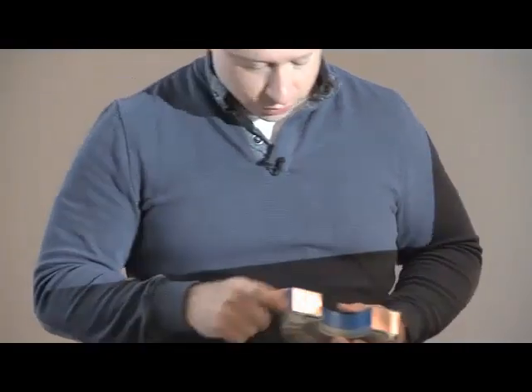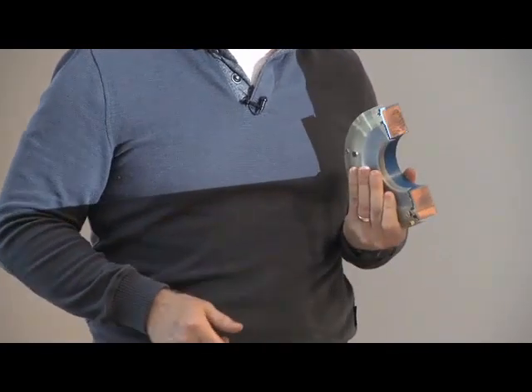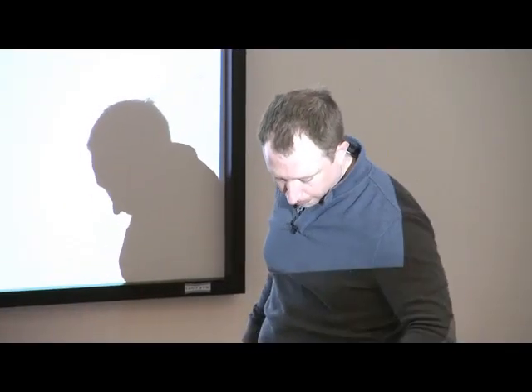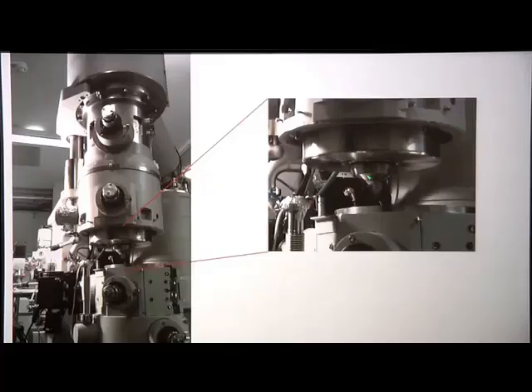But when you're turning that knob on the electron microscope, you're really changing the amount of current that goes through one of these coils. And that's what's moving those electrons around. So, okay, that's a lens. This is what it looks like in the Polara. It's shrouded around with that iron thing that focuses the field, and this happens to be the objective lens.